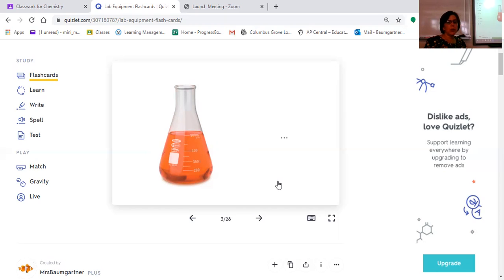So in titration, we put a liquid into this Erlenmeyer flask. The purpose for an Erlenmeyer flask is to mix. So as you're working on this, you spin the Erlenmeyer flask like this, and the substances in the flask mix. So you have above it the burette.